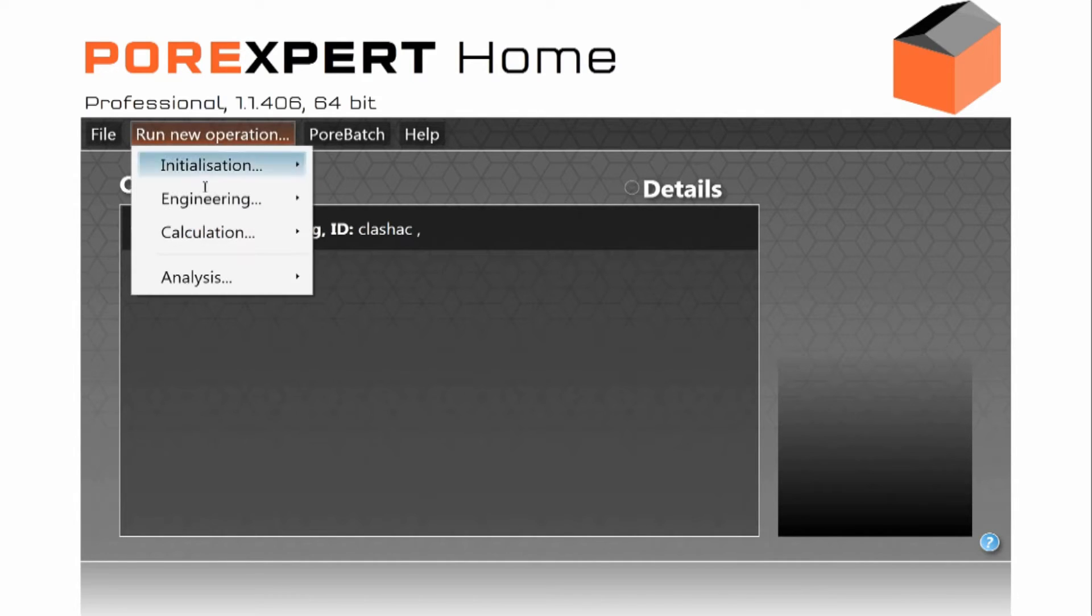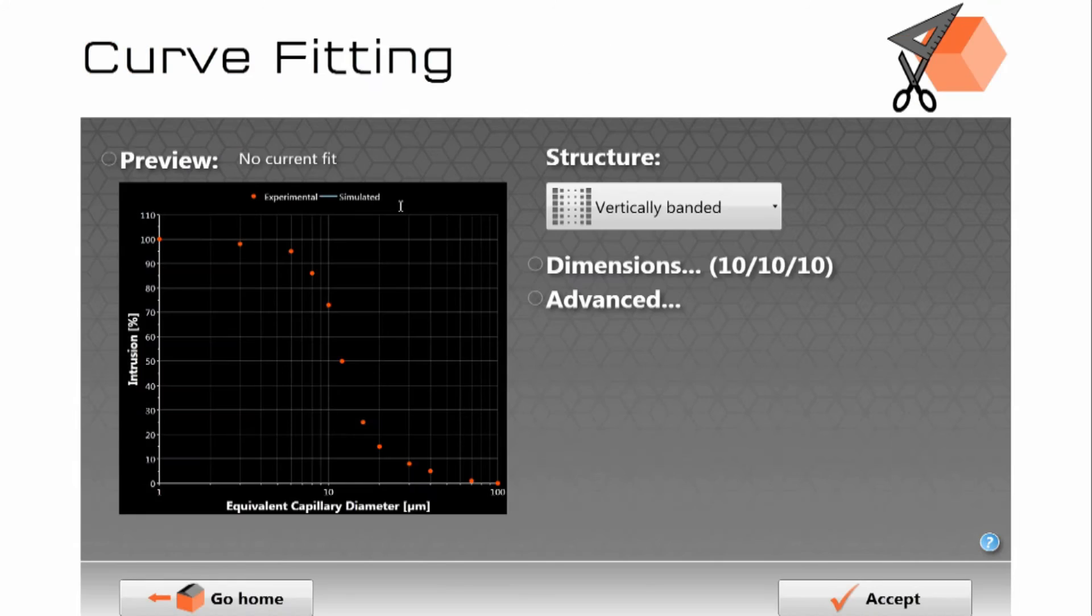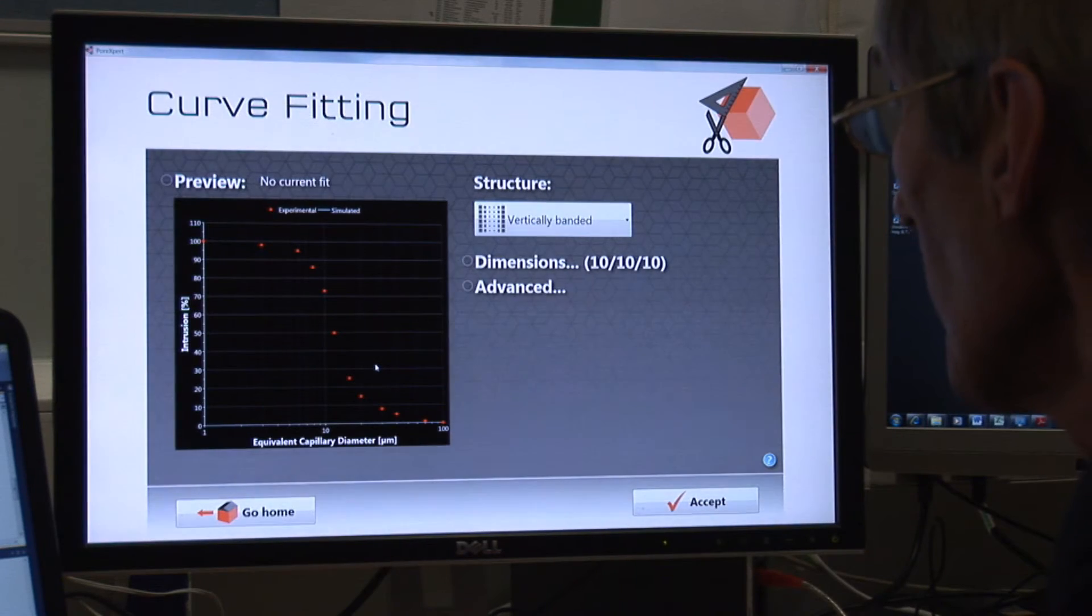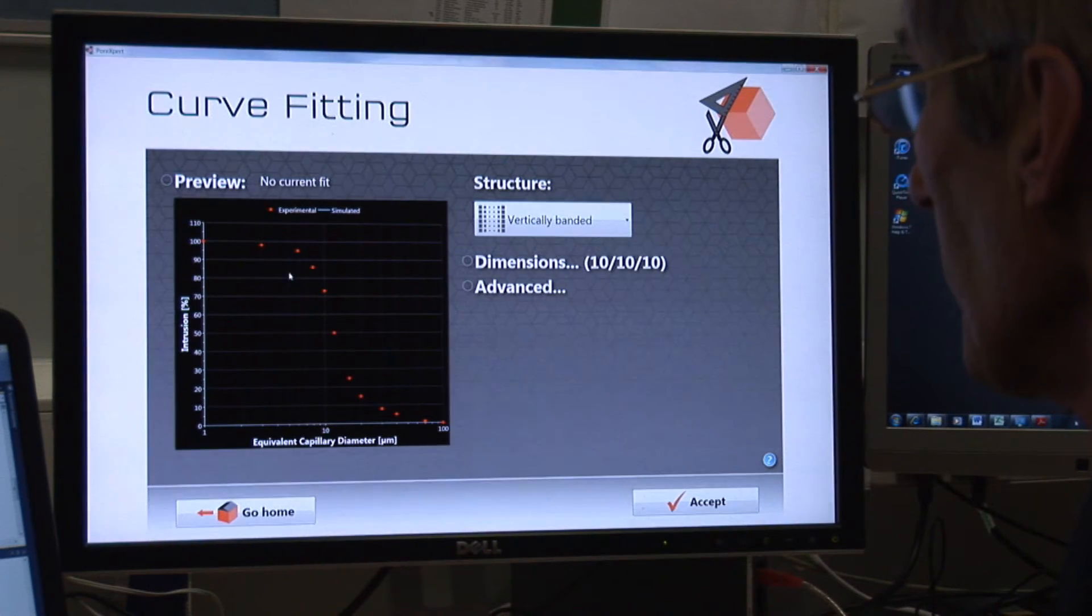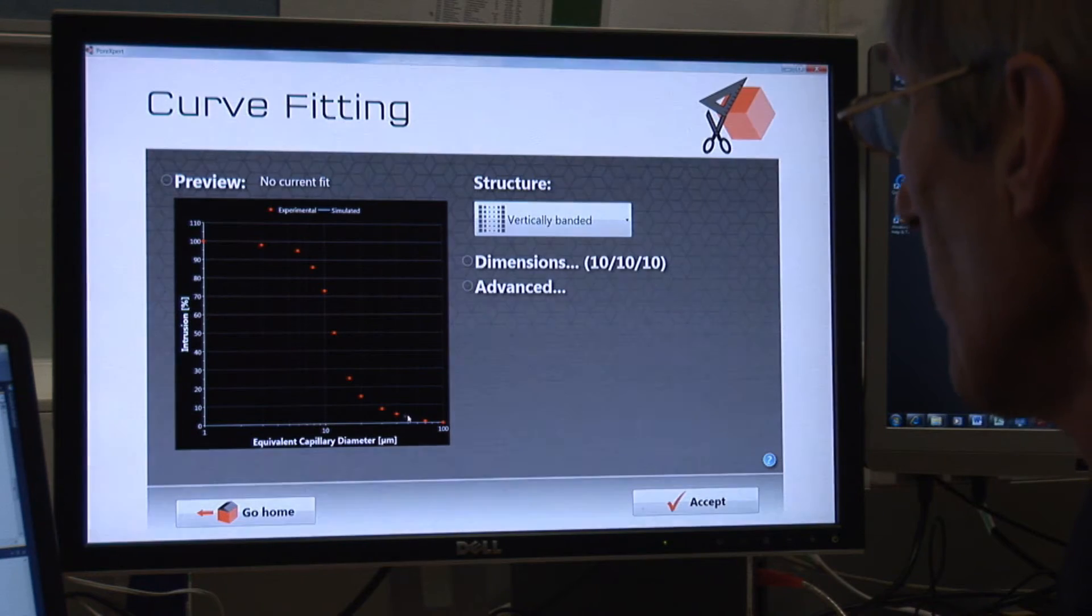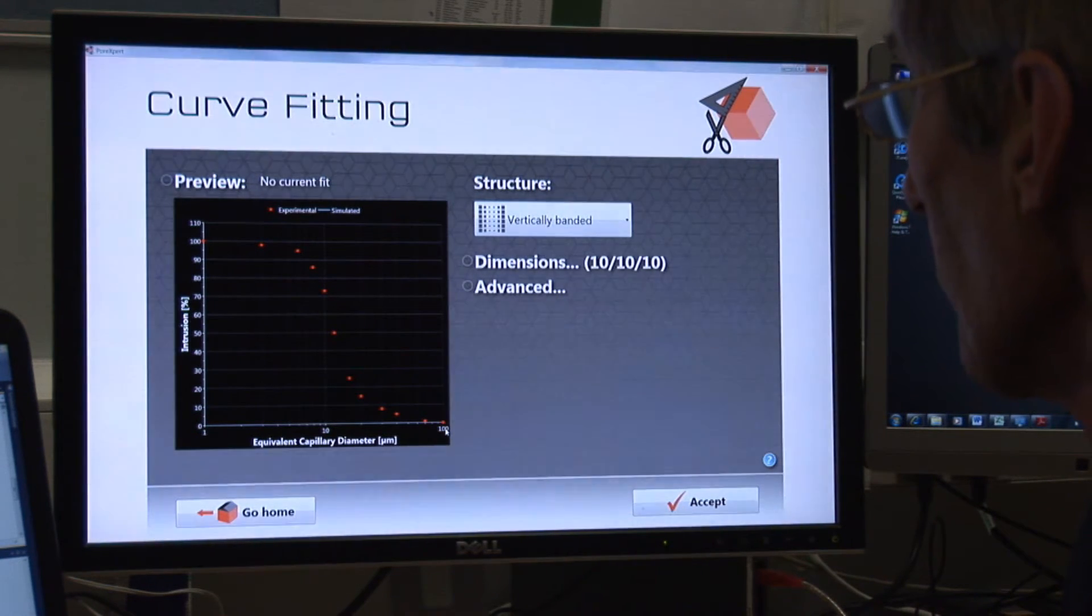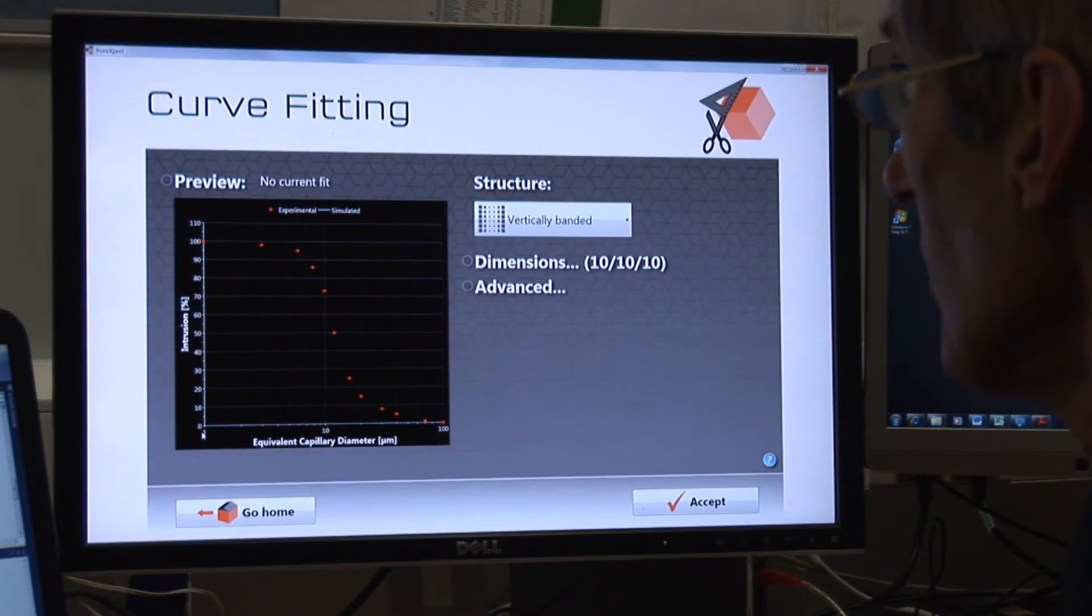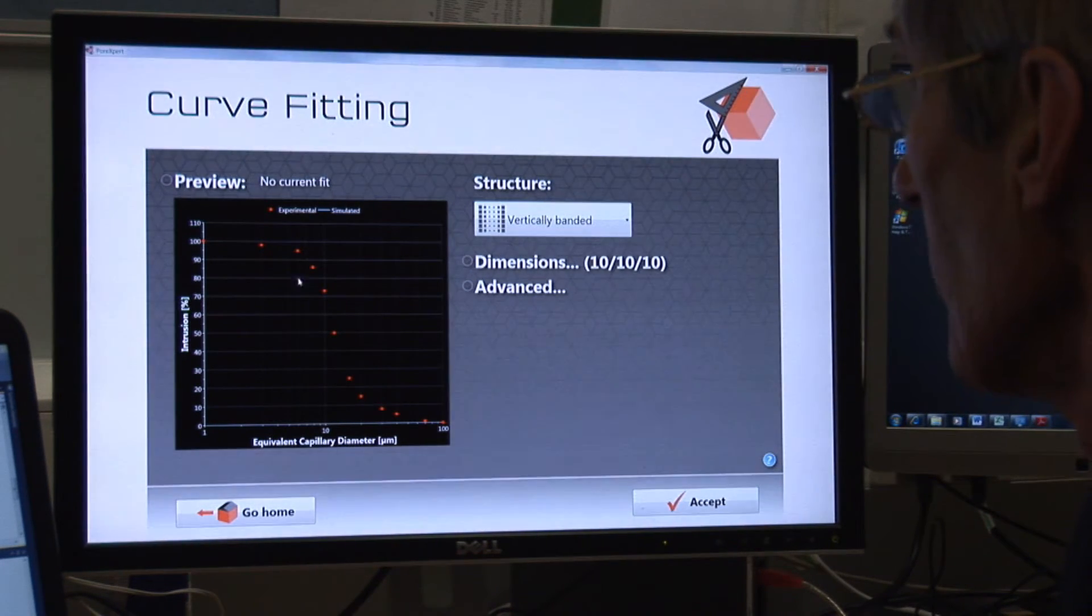We then ask to run the next procedure which is called fitting. So here is the experimental mercury intrusion curve going from low pressure up to high pressure mercury intrusion which is going from large size to small size of capillary diameter for the entry of the mercury.